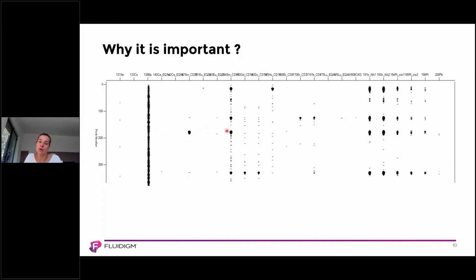to define your events. So the issue here is that all the events here will just be excluded from your FCS file. So you will have an FCS file with no cells because it can't define the cells.